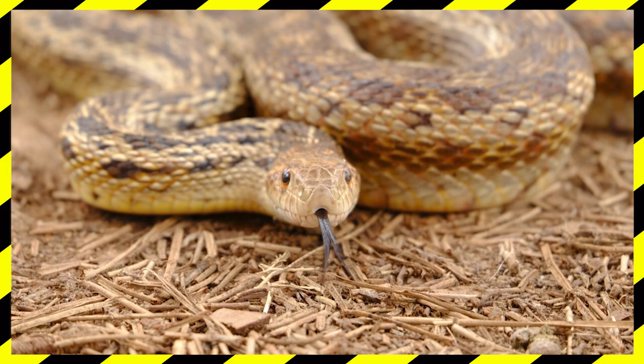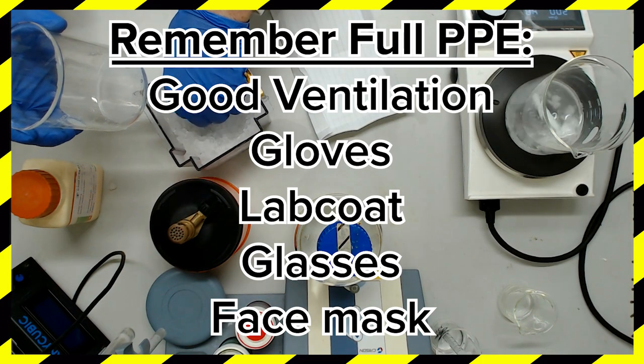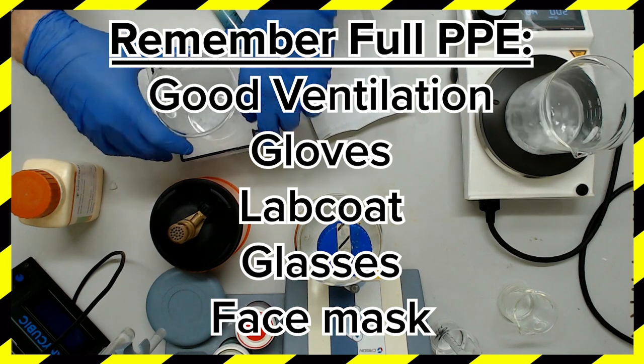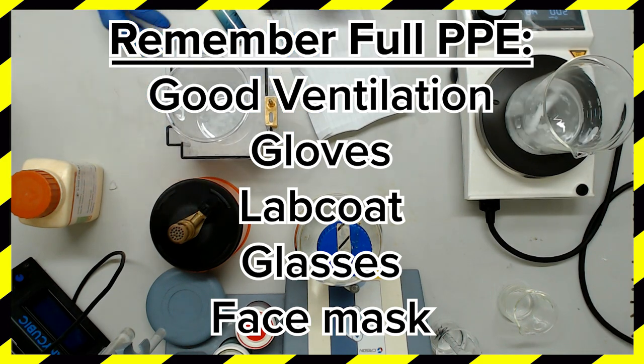Personally, I treat guanidine salt like a live rattlesnake, so I'm yet to experience these effects personally, and I'd prefer it if I never do. Even once buffer N3 is mixed, you're going to want full PPE. Be sure to work in a well-ventilated area for the entirety of this mixing protocol.